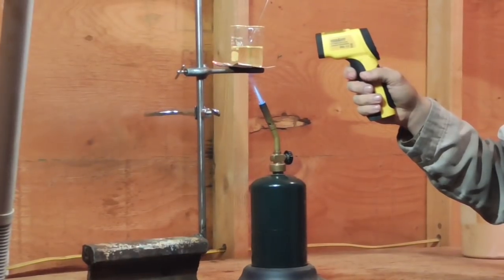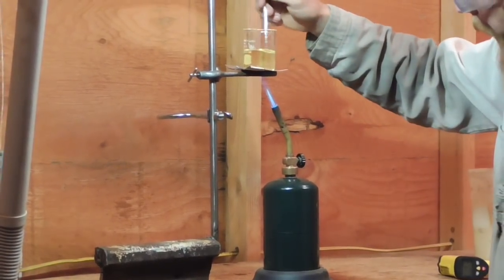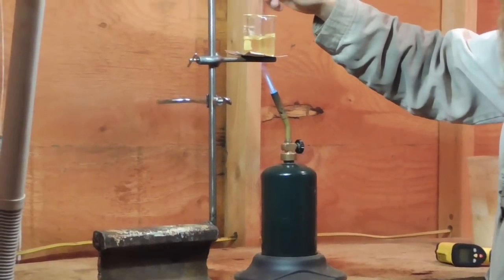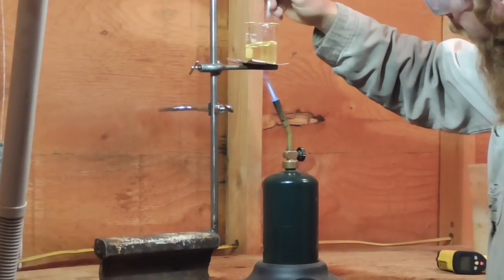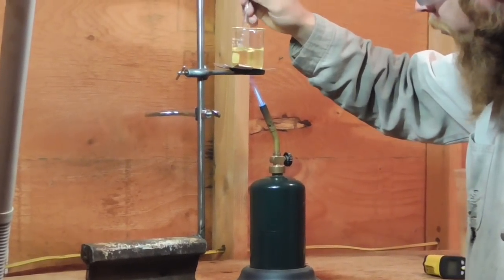We're only at about 170 degrees so far, but something appears to be happening. The sulfur, which was in suspension at first as I was stirring it, has dropped out of suspension and formed little beads on the bottom of the beaker.